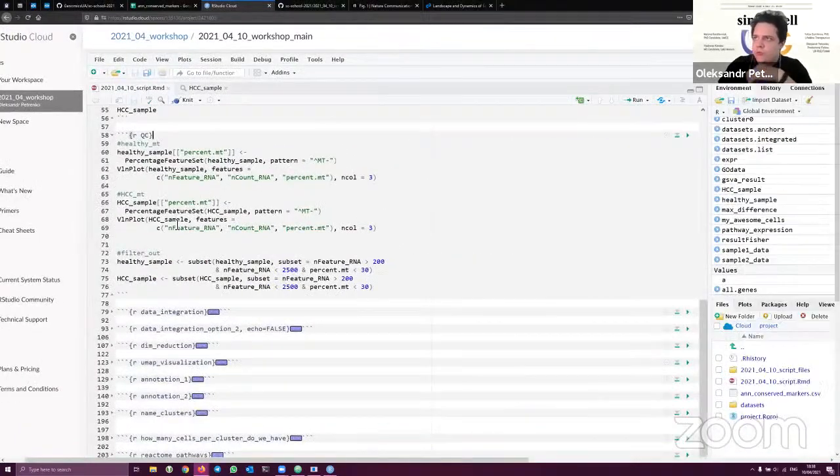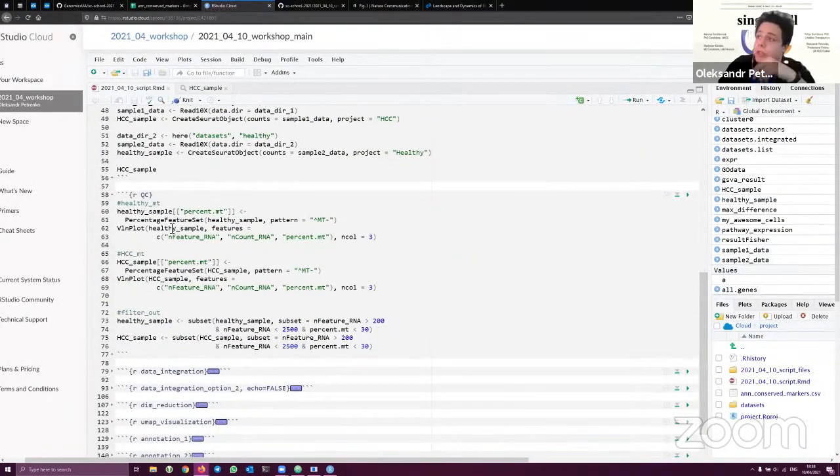Okay, so first of all, we'll try to make some quality control. As you remember, a lot of things should be normalized to something, because I think either Vladislav or Marina already discussed that. Yes, it was yesterday during Marina's lecture. We discussed that mitochondrial content would be a good parameter to normalize for, or to filter out the outliers, because it indicates quite a lot regarding the cells.